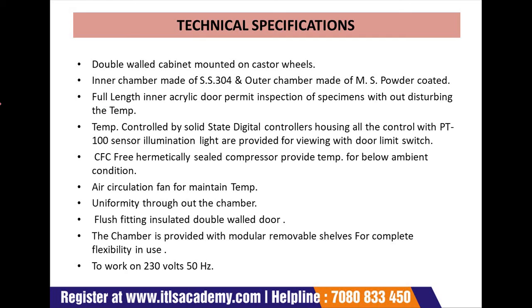In this technical specification, the first one is a double walled cabinet mounted on castor wheels. Second is the inner chamber made of SS304 and the outer chamber made of MS powder coated. Next is a full length inner acrylic door that permits inspection of specimens without disturbing the temperature.